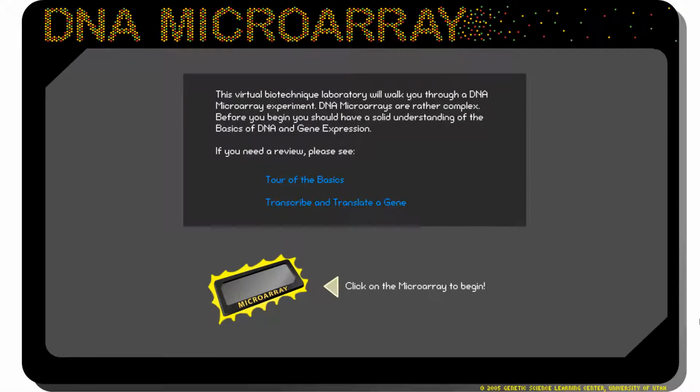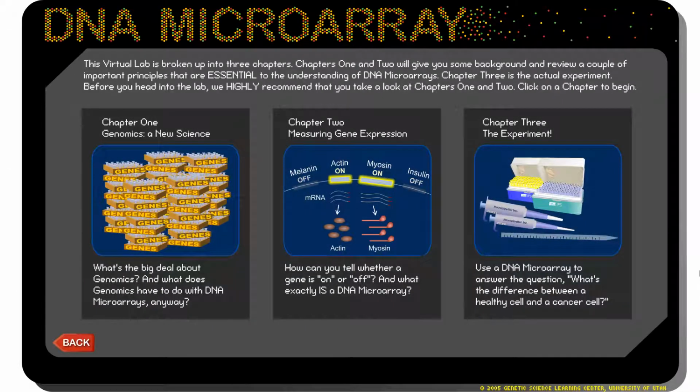Let's now have the microarray experiment. Unless you have mastered the basic processes in the central dogma of molecular genetics, this virtual lab might be hard to grasp. It's better that you review it first. But again, I'll try to explain things as we go along in each step of this lab. Alright, so I think it's good that we have some review sections here first before we go into the experiment proper. Let's start at understanding genomics.